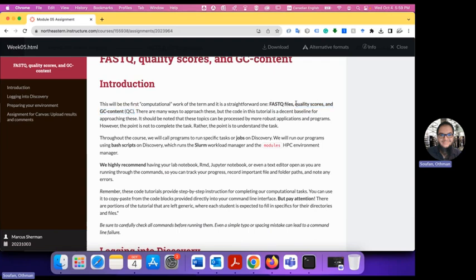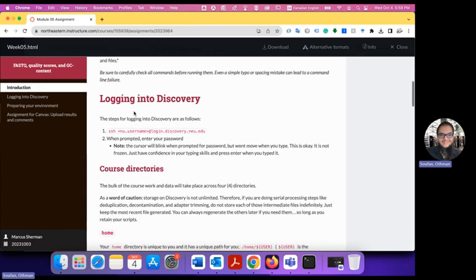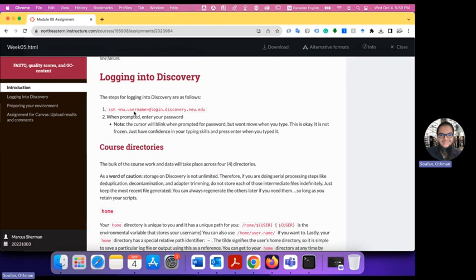And one of my treasure hunt questions was actually related to how we compute quality: how to compute the quality score for one full read if we know how to get the quality score for a single nucleotide, and then get the GC content, which is just counting the numbers of guanines and cytosines, and computing the percentage for that. Okay, so let's do this.